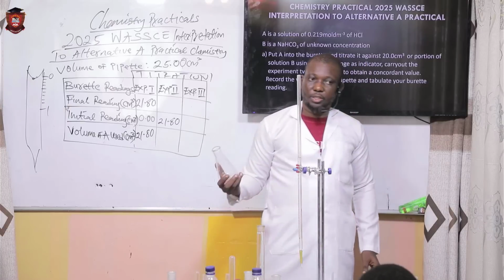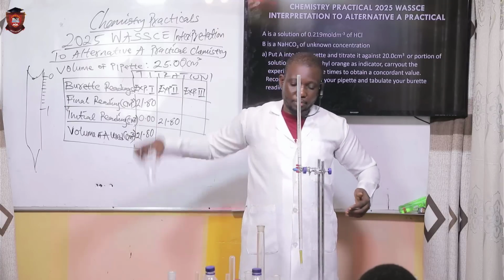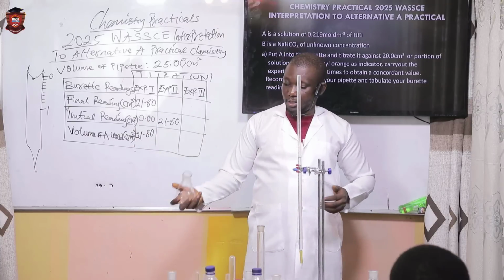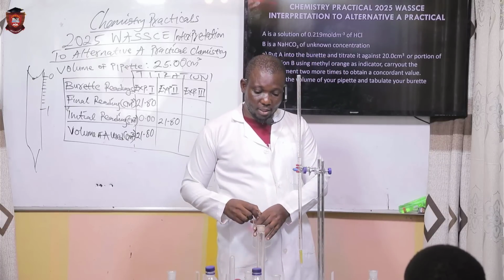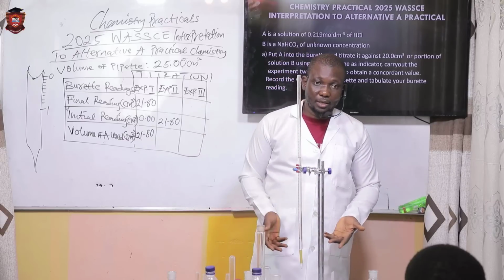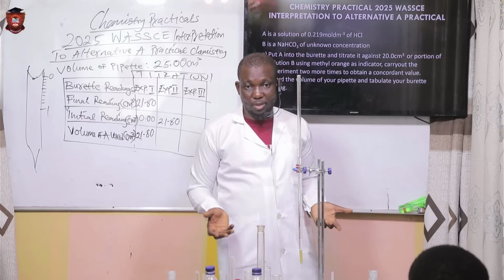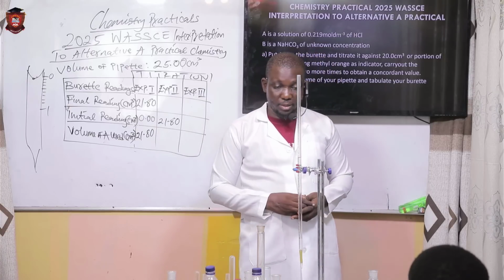Sometimes you don't wash. Some people start washing this. You don't need to wash. It's already air dry immediately, so you don't need it, because if you're washing, that means it is no longer acid base titration but water titration. So you don't need water here. What you need is acid and what? Base. That's why it is called acid base titration. If you put water here and start to rinse, it's no longer acid base titration.